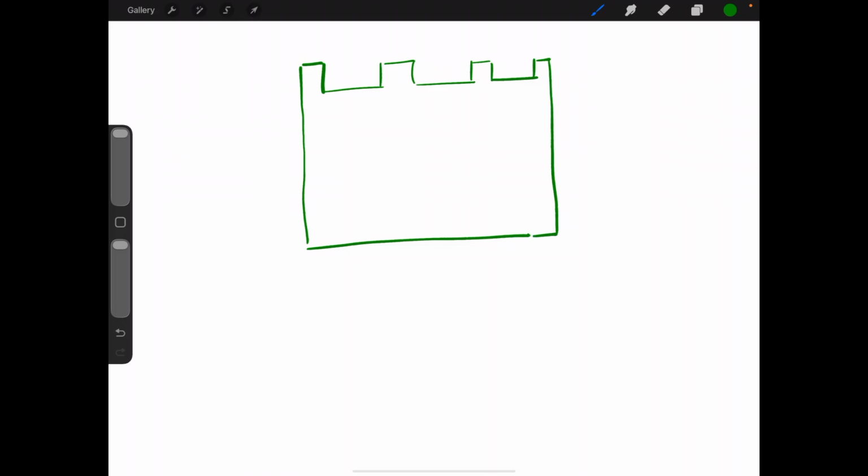In this first lane, DNA recovered from the crime scene will be running, and the second lane is for suspect A, who could be the criminal, or suspect B. Either A or B, they can be the criminals.